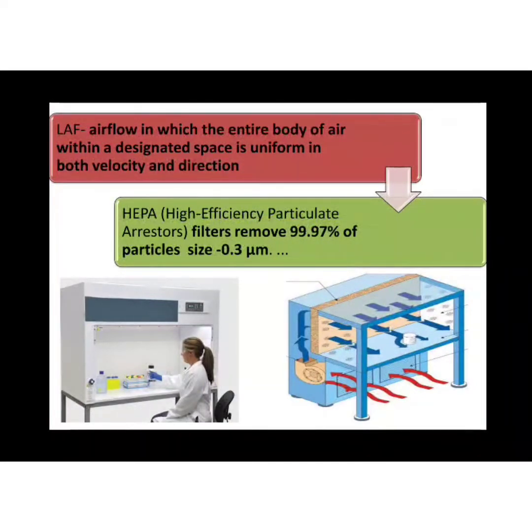If you see the construction of the laminar airflow bench, this is a closed cabinet with a glass door. The glass shutter can be opened when we are working. A person will be sitting in front of the working bench, and there will be a gas burner switched on there. Before starting the experiment, I need to clean the tabletop, close the shutter and switch on the UV light for 20 minutes, because by the UV rays the microorganisms on the working platform can be killed.